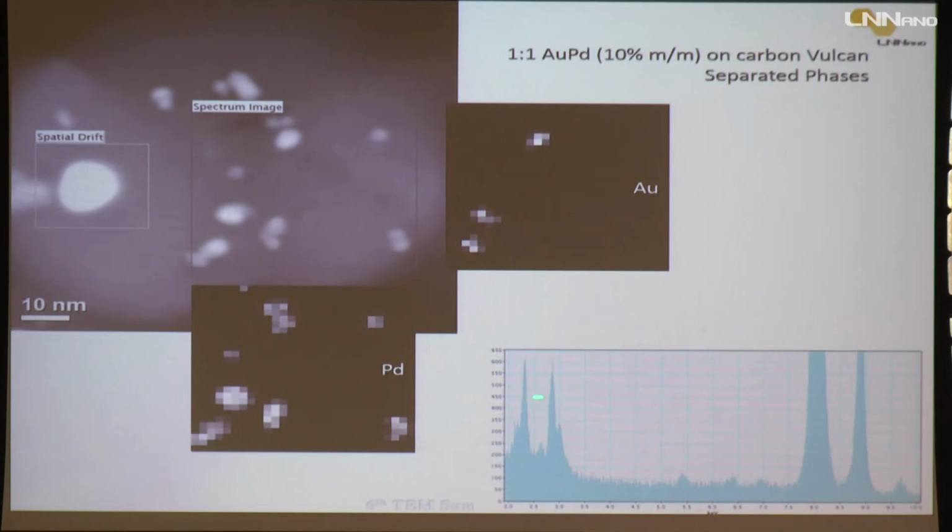I am interested in the same shell of the elements, because then there is the same probability of generation of the photons and so on. Then the comparison is more reliable, okay? And then what we can see here is this region that was mapped.